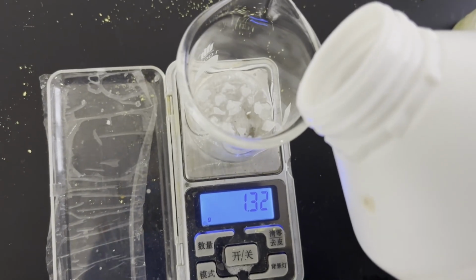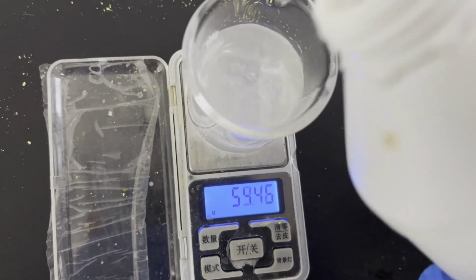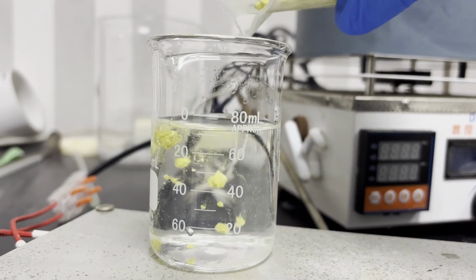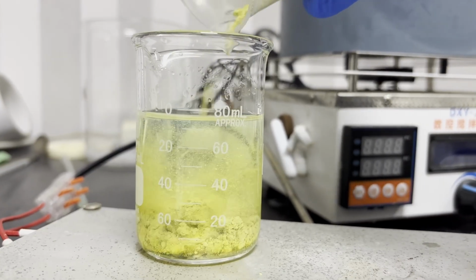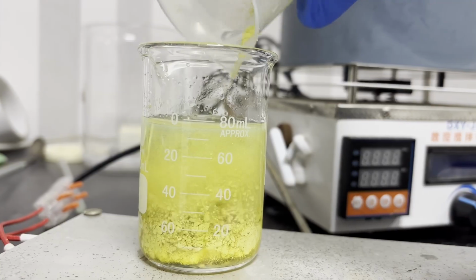I weigh out 1.3 grams of potassium hydroxide and dissolve it in around 70 ml of ethanol. I then heat it up while adding 4.1 grams of my crude acridone. This is where things went wrong a little. The paper said that acridone dissolves in hot ethanol KOH to give a clear yellow solution, but I found that things just don't want to dissolve.